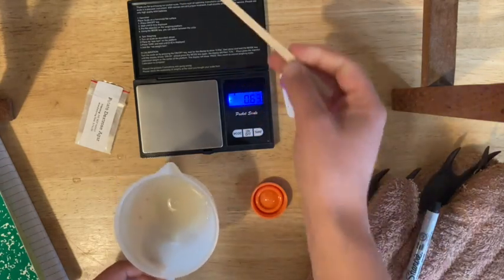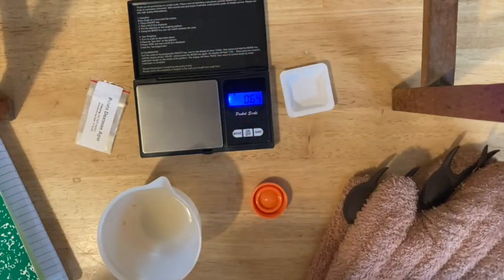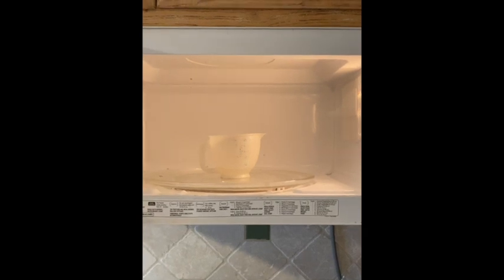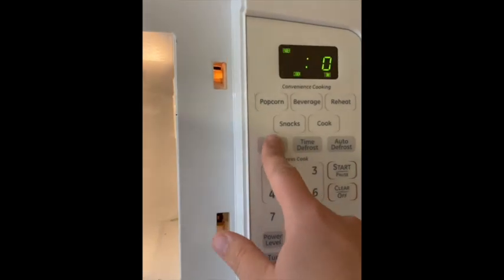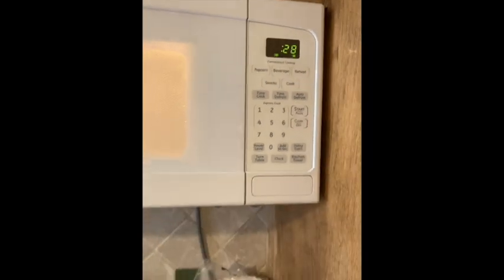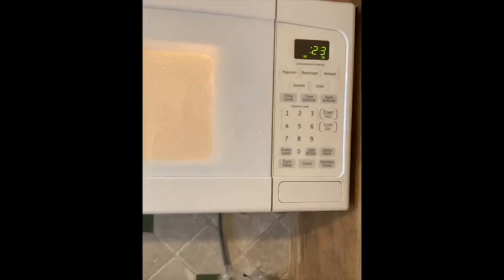Make sure you're wearing your safety glasses for this. Bring the wooden stir stick and your hot hands to the microwave. Using your hot hands, put the potato dextrose agar and water in the heatproof container in the microwave. Set it for 30 seconds at half power, close it up and start. Once done, use your hot hands to pull it out and your wooden stir stick to stir and see if it's all the way dissolved.